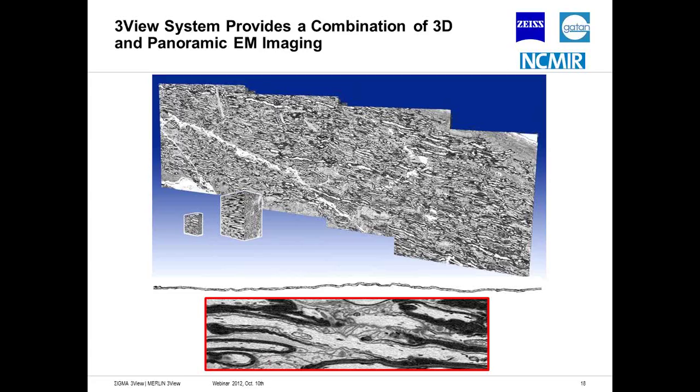They've had a system for a while, and they are interested in the central nervous system. And so we look at the back panel here. These are 4 3D data sets. Each image is 8,000 pixels by 8,000 pixels, and a couple, I think about 500 images deep.